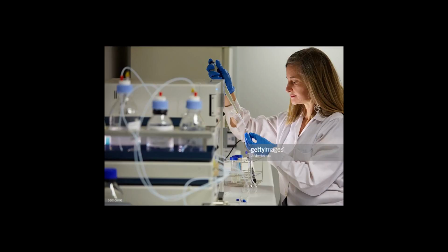Due to gradient solvent pumping, and low throughput, due to low column loadings. Displacement chromatography has advantages over elution chromatography in that components are resolved into consecutive zones of pure substances rather than peaks, because the process takes advantage of the nonlinearity of the isotherms. A larger column feed can be separated on a given column with the purified components recovered at significantly higher concentration.